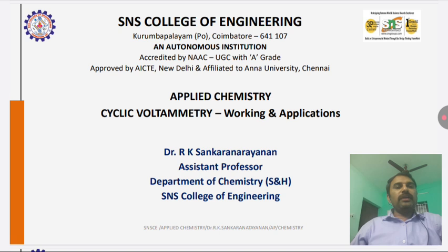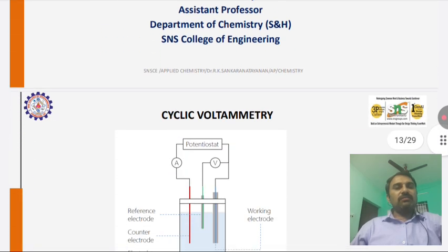If you want to do any material analysis, study current flow, or oxidation and reduction in metal oxides or metals, or apply it in battery concepts, energy storage devices, or energy production, cyclic voltammetry is the preliminary analytical tool to study the current flow, whether it is oxidation or reduction, and we can conclude the current and voltage with its help.